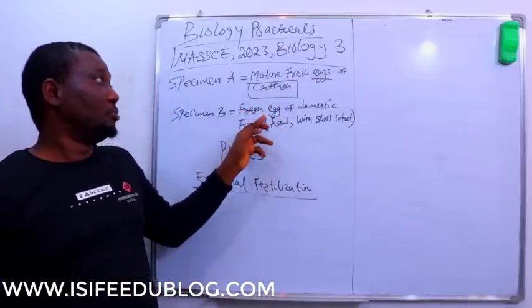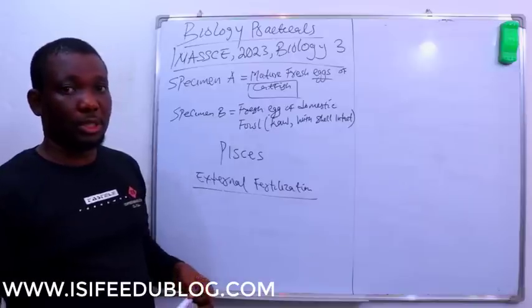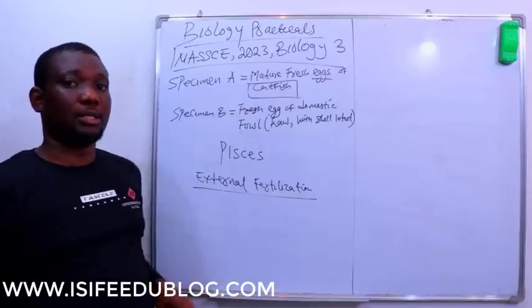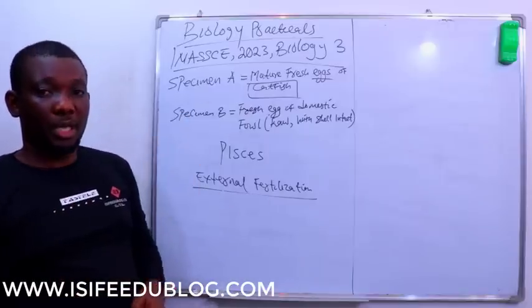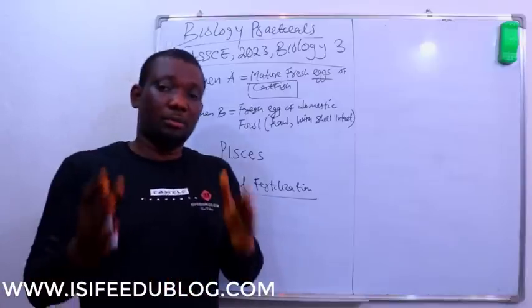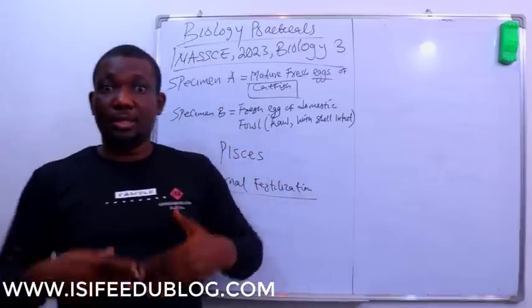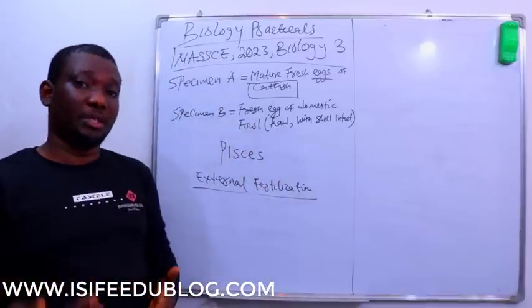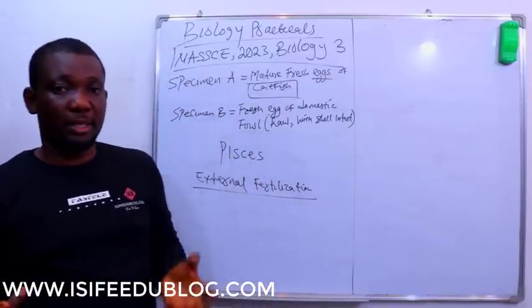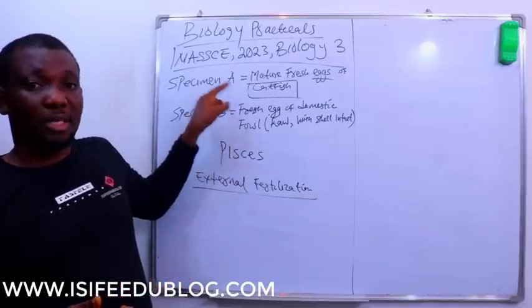I mean that we know our normal egg, say a raw egg. So it means that it might be a cooked egg or just a raw one. Looking at the egg, the oval shape of the egg with shell. Looking at the two eggs, A and B, and comparing both by size, there's a structural observable difference, which I'm still going to be listing under differences between specimen A and B in terms of the size. It appears that this has a much bigger size than specimen A.